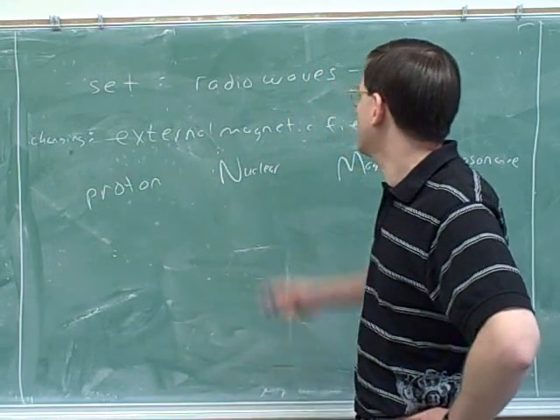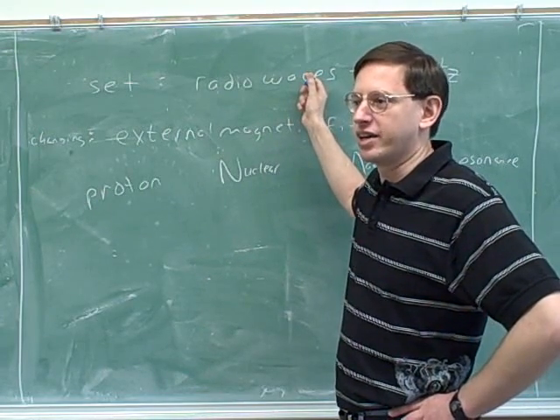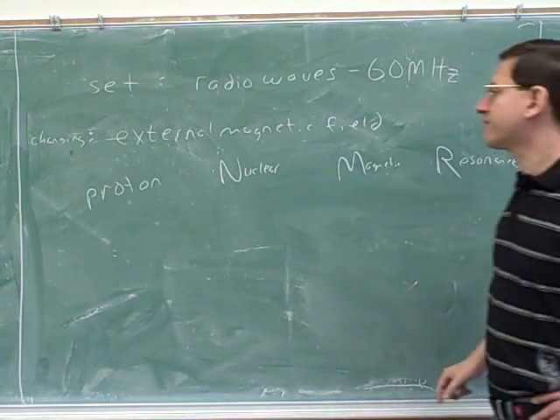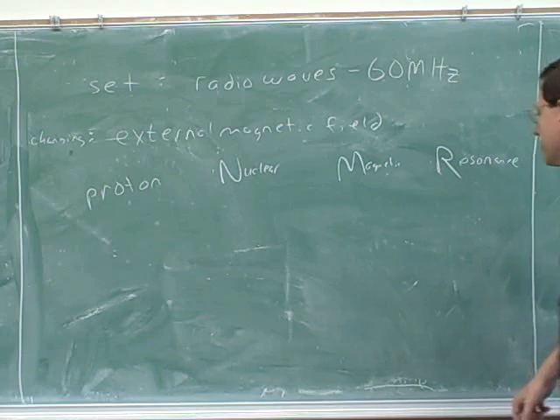After all, remember, what we're shooting here is radio waves. And for IR, you'd be shooting infrared electromagnetic radiation. Okay, all right, infrared is also important. Usually NMR is the most important tool, though, for spectroscopy.